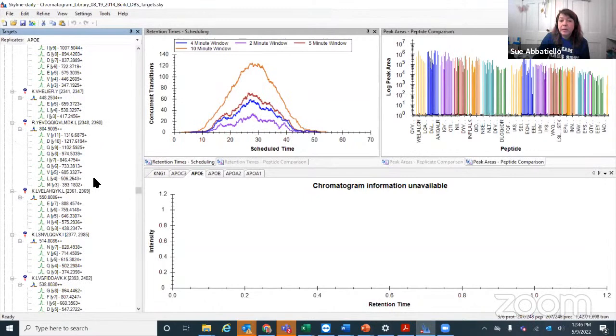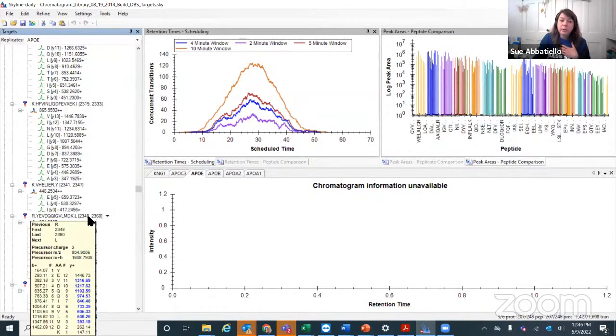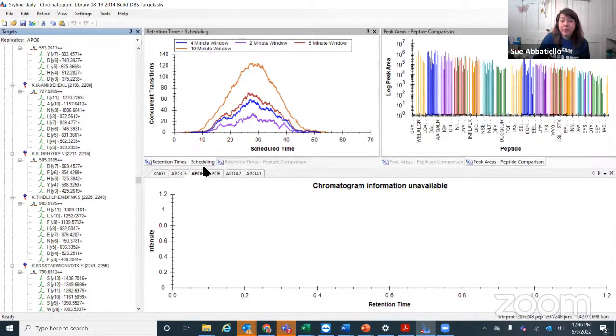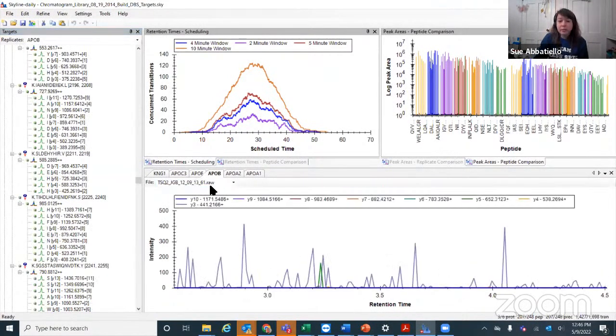In my opinion, I would base it on what your needs are. If that is the only signal in the entire chromatogram you can see, and there's no other peak that would be like a second best, then I might keep it. And if it's the only peptide for that protein, I might keep it until I'm done with the method development and make my decision to keep it or axe it at the end.